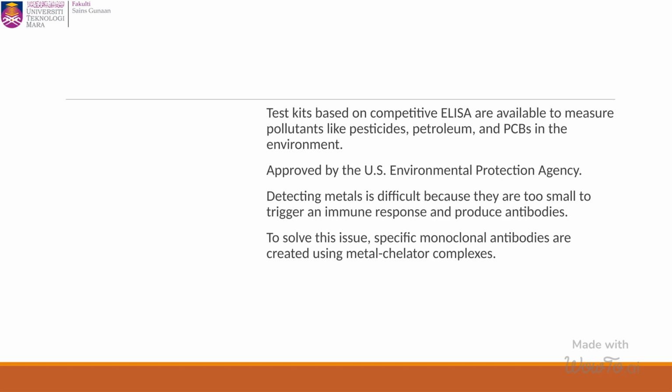Commercial kits use various methods to capture contaminant antigens, offering sensitivity comparable to traditional approaches for detecting organic contaminants like pesticides and PCBs. These kits provide detection limits from high parts per billion to low parts per million. In a 1996 study comparing a commercial immunoassay kit to GCMS analysis for 161 samples from a PCB-contaminated site, the immunoassay had a 3.1% false positive rate and an 11.2% false negative rate.